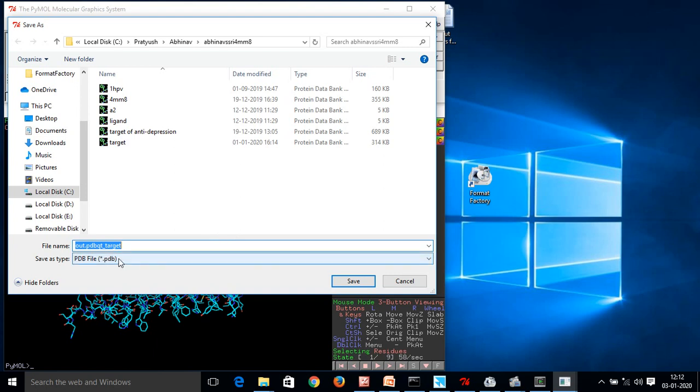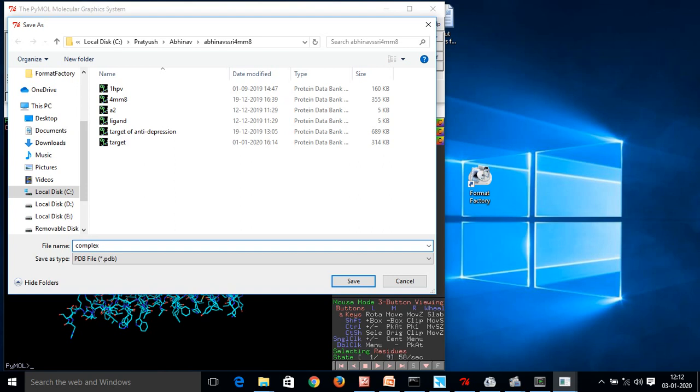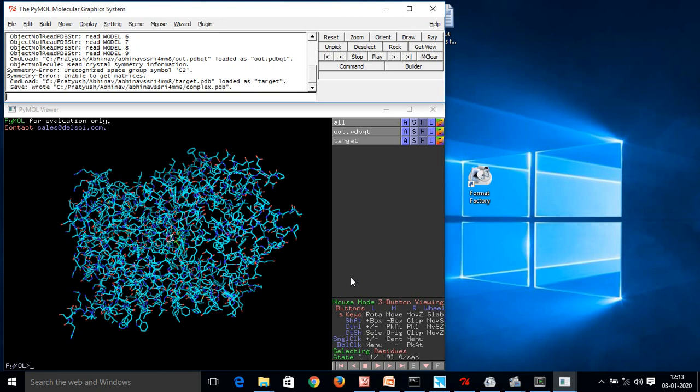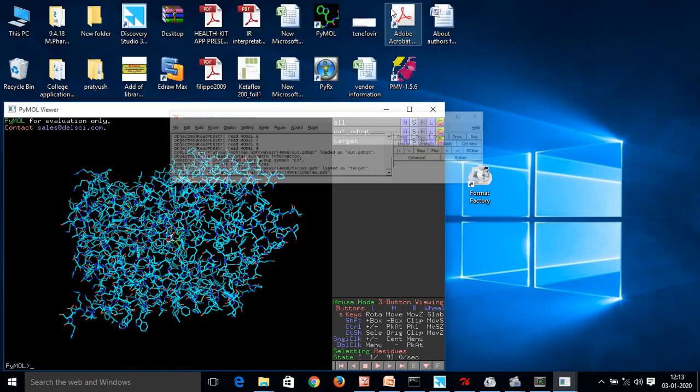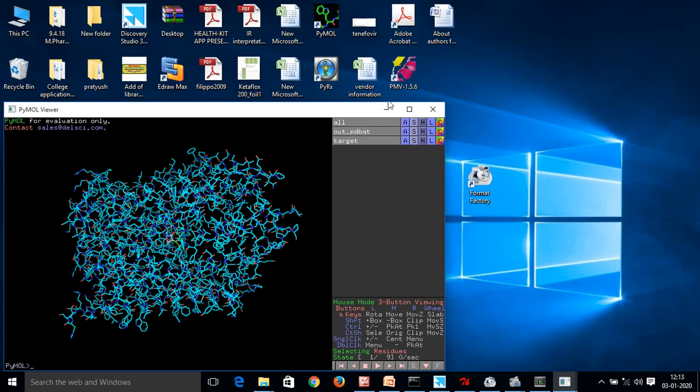Now it is asking where I want to save this file. And I have to save it in pdb format. So this is my file name, out target, out dot pdbqt underscore target. This is a complex file. I will rename it as complex. And save in the parent folder only. Now here our work of PyMOL has been completed.